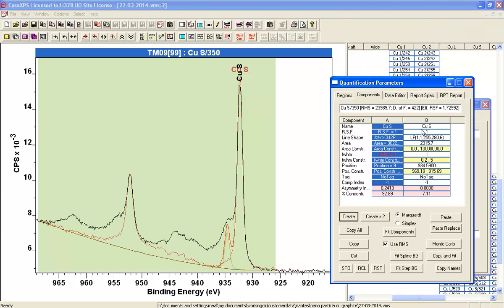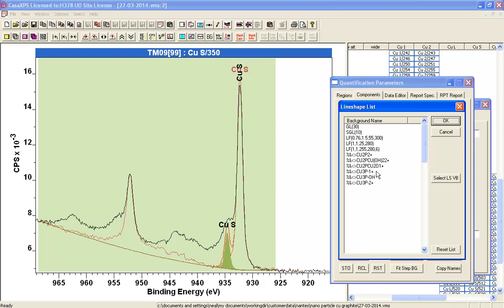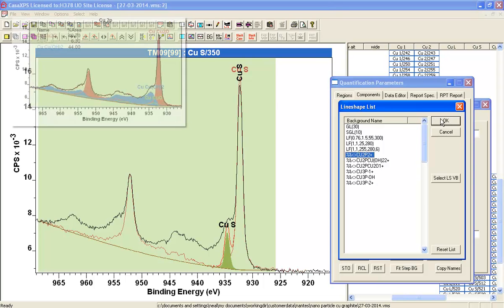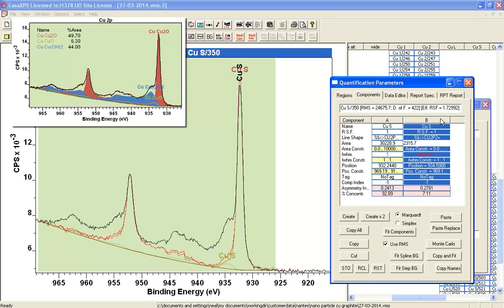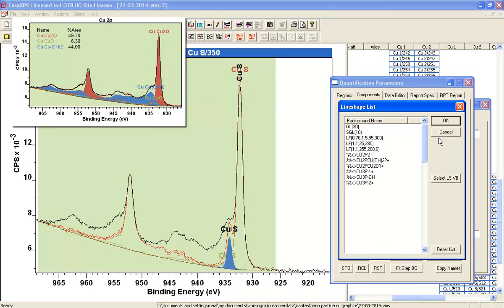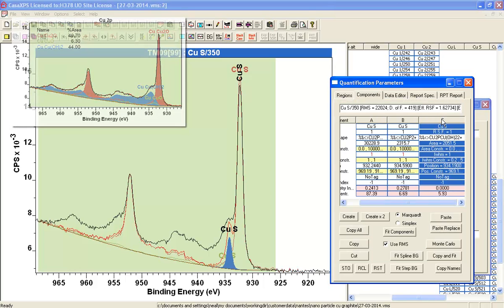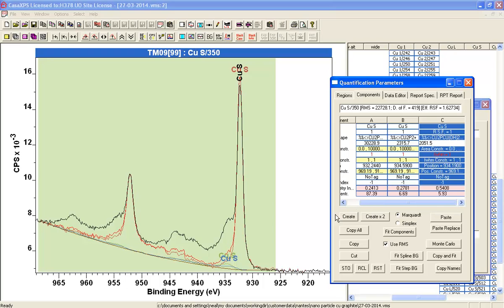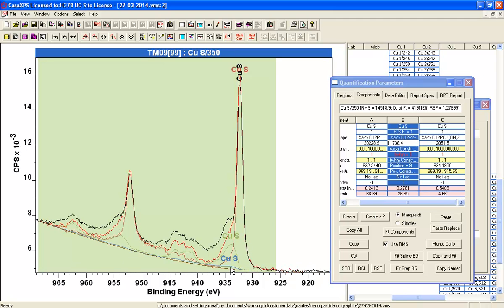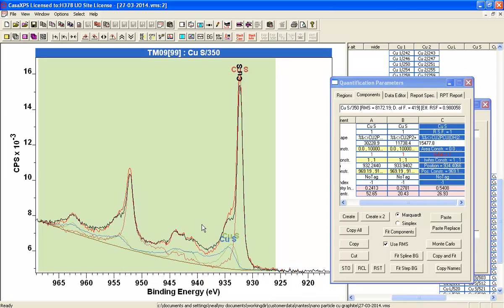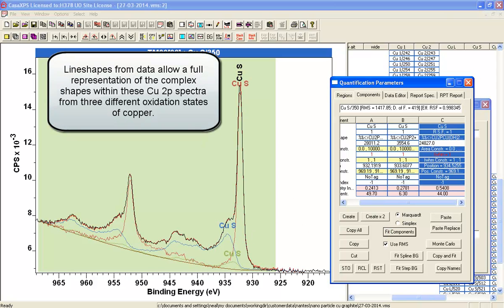And when I create the second one, again, I need to add, and this is going to be the 2 plus oxide. And then I want one more, because there's another option, which was a 2 plus hydroxide. So we've now got line shapes that will give us a chance of fitting these data. As you can see, the line shapes fit these data quite nicely.